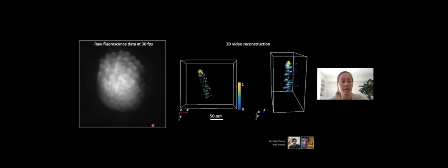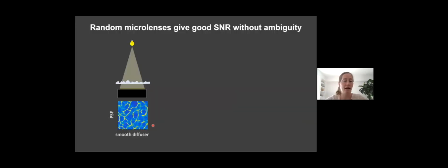Okay, so now I want to talk a little bit about the diffuser. I used to give this talk and everyone would ask, well, what's the best diffuser to use? Can you design a better one? And yes, the answer is yes. So these smooth diffusers are what we started with. These are like the holographic diffusers from Edmund Optics.